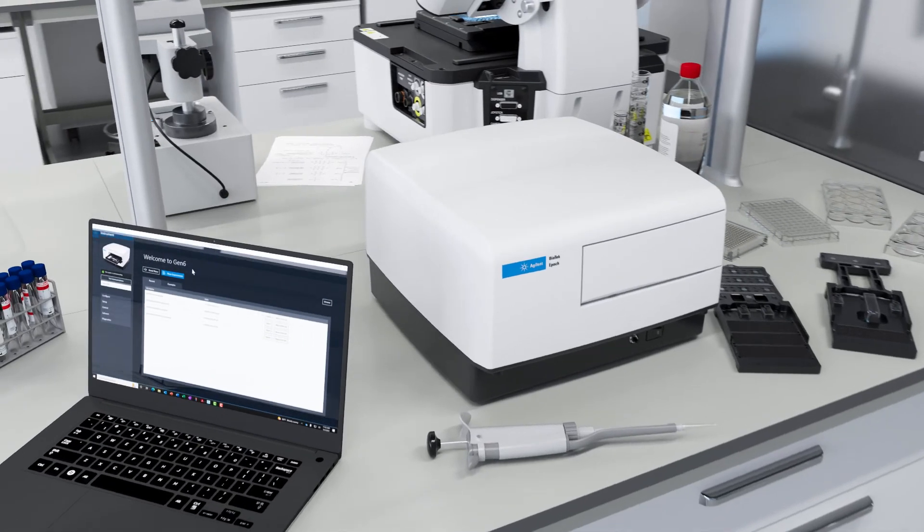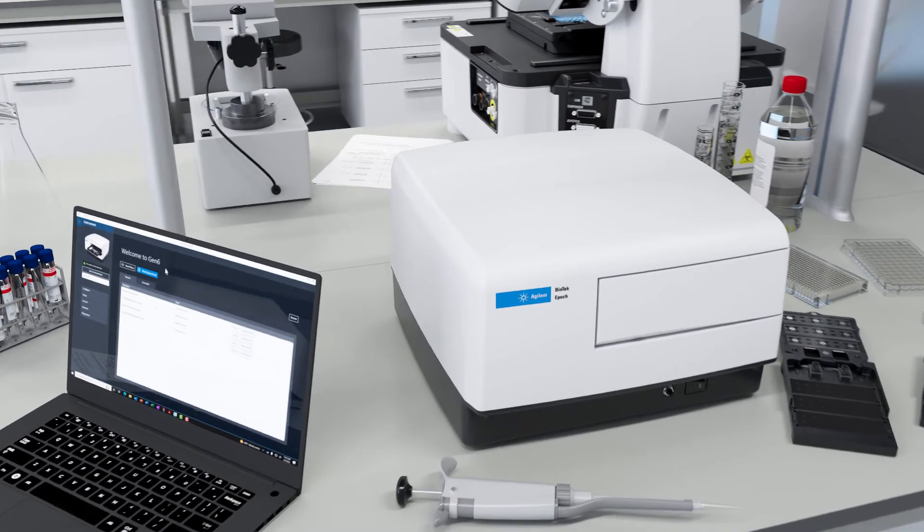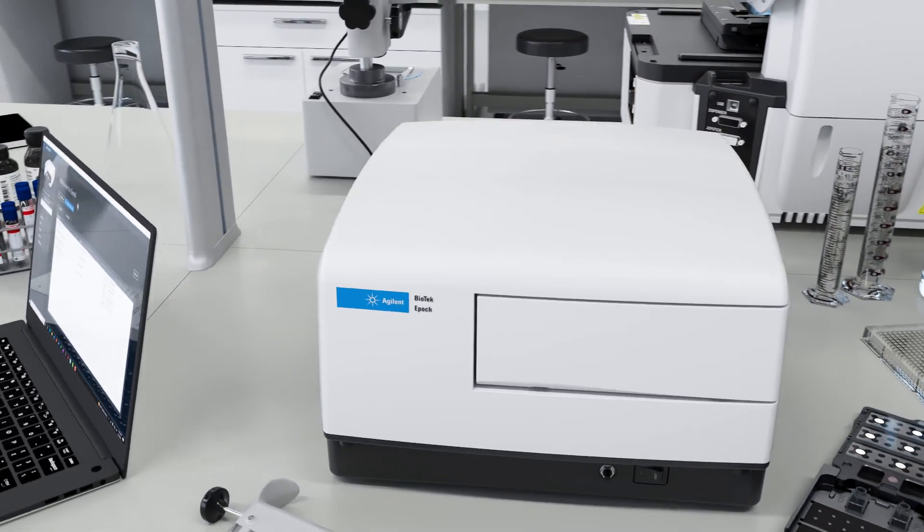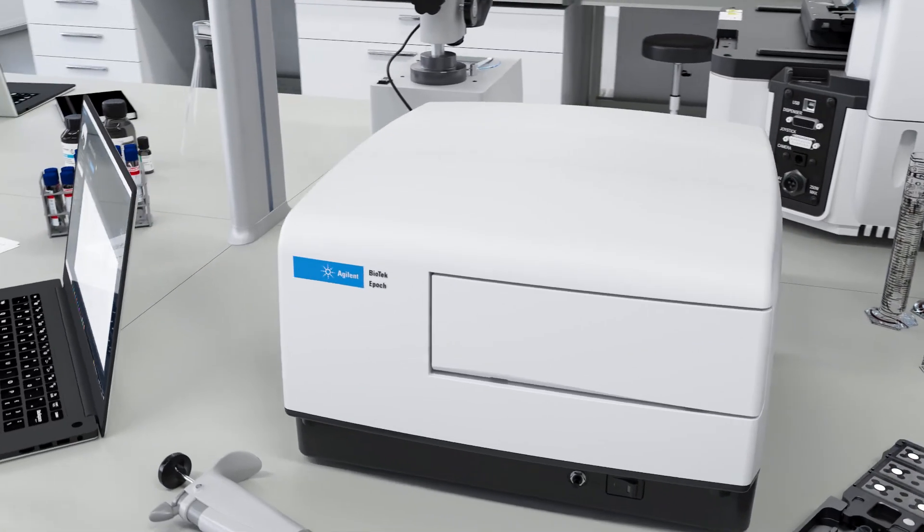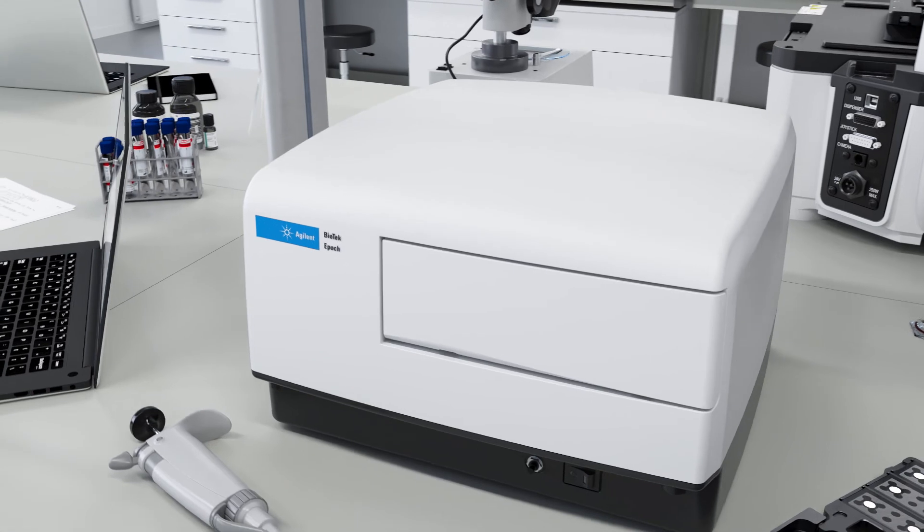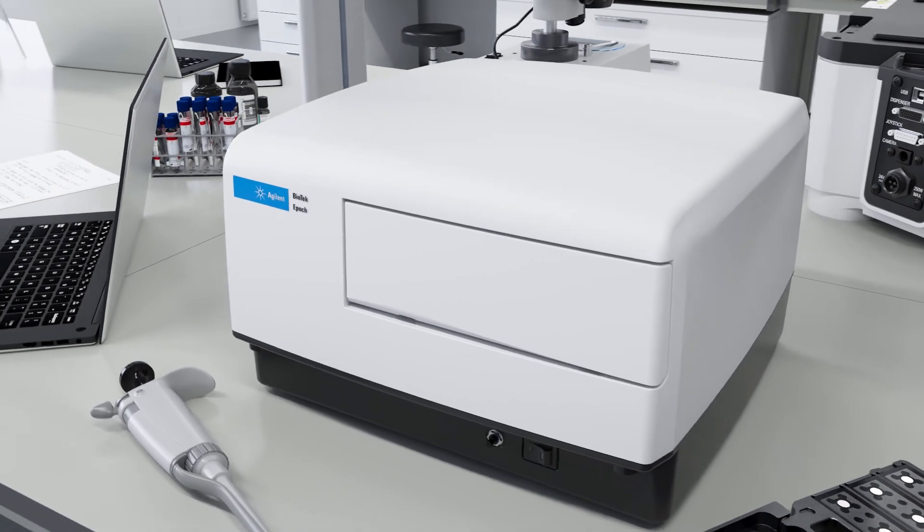Epoch is Agilent's most cost-effective monochrometer-based absorbance microplate reader. It's fast, reliable, and accurate. It's the choice for hassle-free operations.